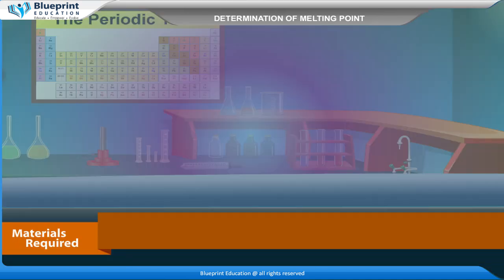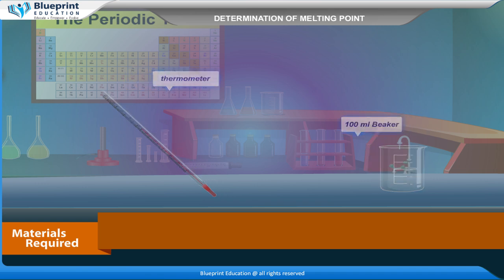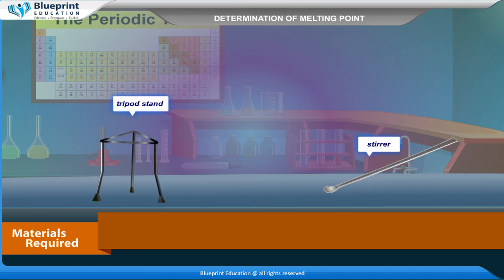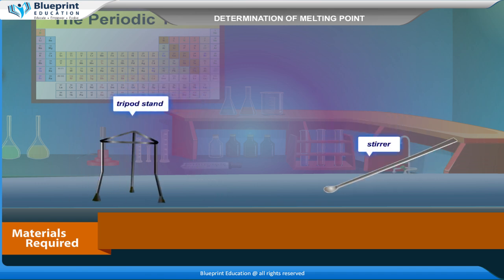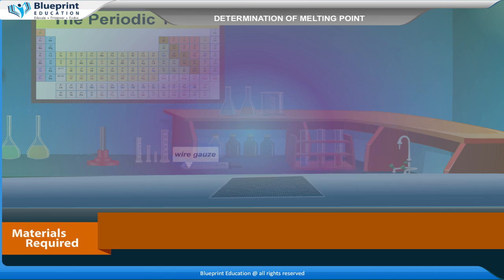Materials required: thermometer, 100 ml beaker, tripod stand, stirrer, thin-walled capillary tube, heating medium — water or paraffin, wire gauze, etc.